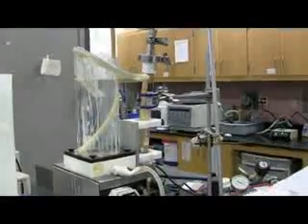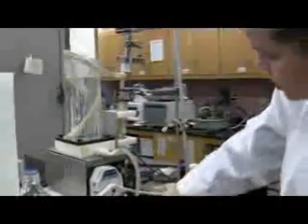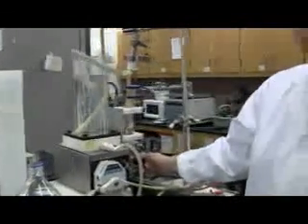We have a pump and a tank. And the pump down here is going to flow the fluid from the tank through the membrane system down here. Down here we have a valve, which makes sense to leave always open.